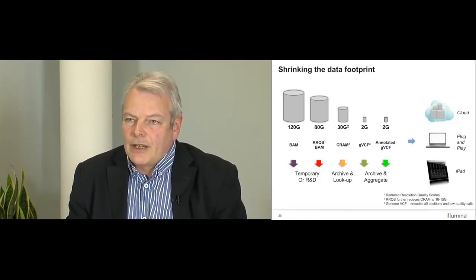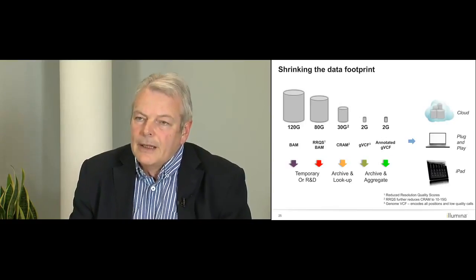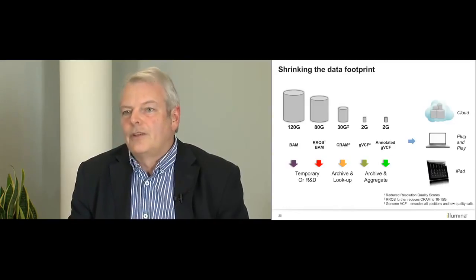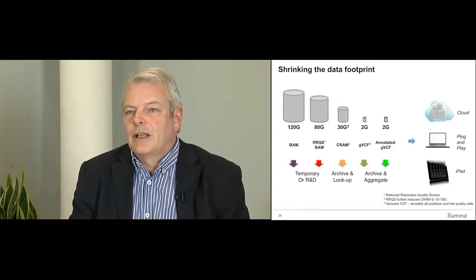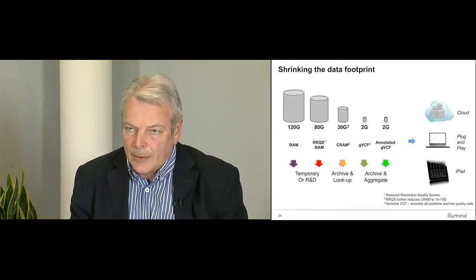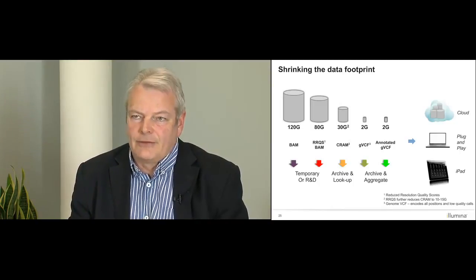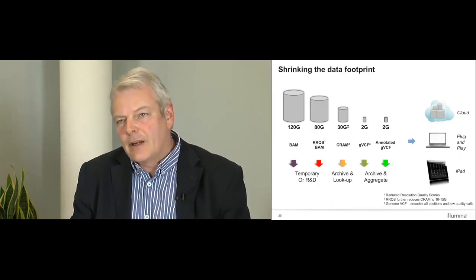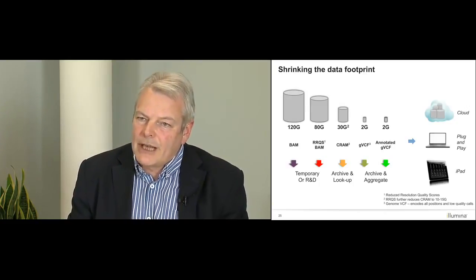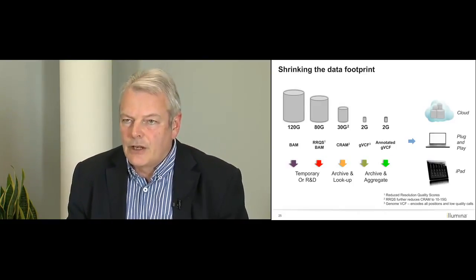These are actually GVCFs, and I don't have time to go into the importance of the G, except to say that these GVCFs store information on every variant for future clinical interpretation, but they also store information on the quality of every homozygous call in the entire genome. And this is very important to be able to call if there is definitely not a variant in a particular position. That's a very important piece of information to know in the clinic, to be able to say you definitely do not have a mutation in this exon, as opposed to saying I can't see a mutation in the exon.